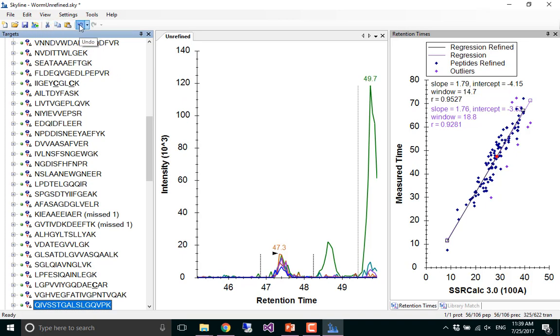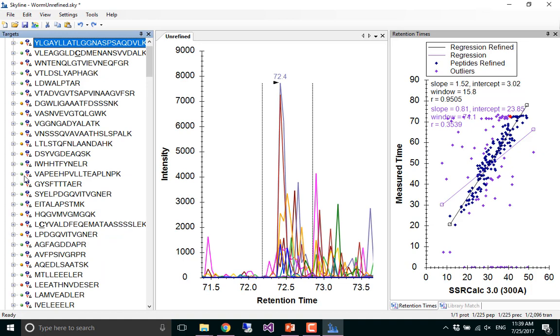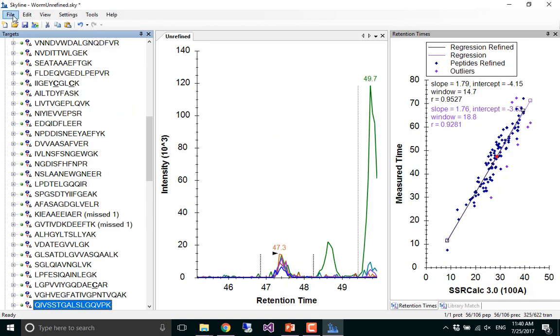Okay, so let's just undo that. And now, well, sure, let's go see. I'm going to redo that. So let's think about if we were to schedule this. Hopefully we have 622 transitions. Maybe we could get those all into one run, and then we can start doing scheduled replicates, right?